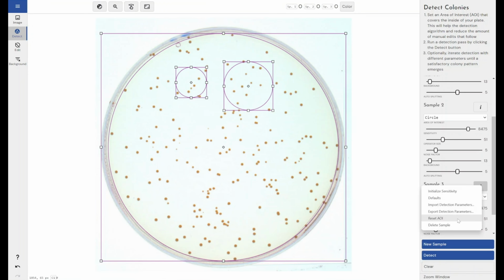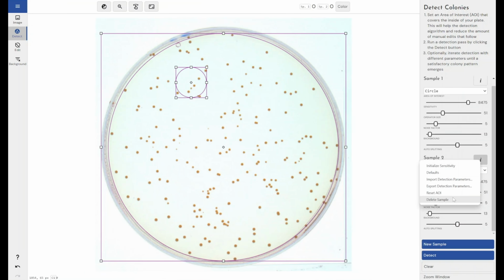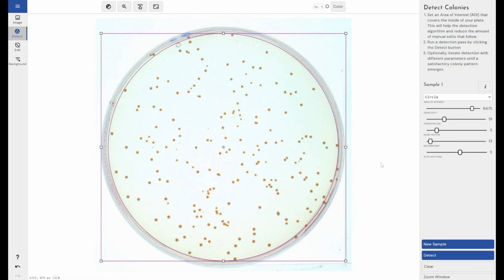So you don't have to do things one by one. You can take an image of a whole plate and get the software to automatically detect colonies within those. So that could save an operator a huge amount of time if they had, say, 6 agar plates that they needed to count. They could image them all at the same time and count the colonies all within one click. Big detect button here. Rather than doing one, finishing, moving on to the next one, counting, moving on, you can see how this would take much less time, be much easier for the analyst or the operator to perform.